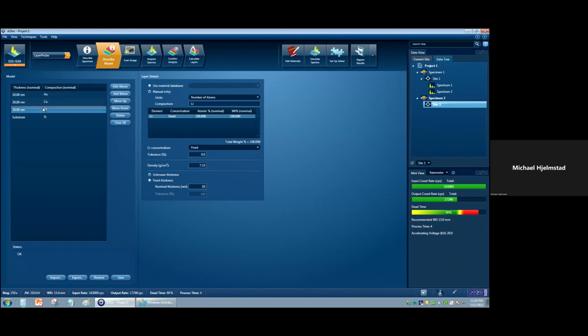I mean, you can come back through and check them all really quick, but when you're happy, you hit save. Other thing to keep in mind too, this isn't something that we expect you to do over and over again. So when you've saved these stacks, make sure you import them and export them so you have it. If you have to go to another microscope and measure it on a different microscope, I know we got Layer Probe on a couple of systems here at Nuance. Take them with you. Why reinvent the wheel, right?